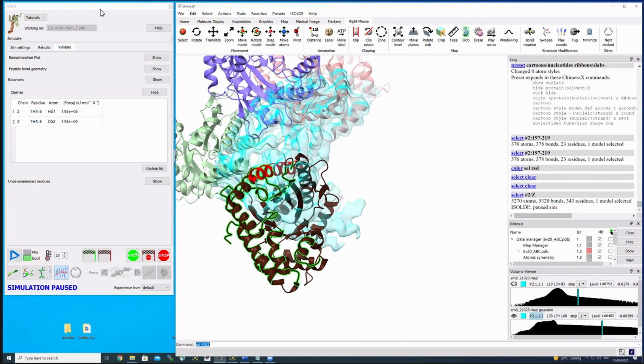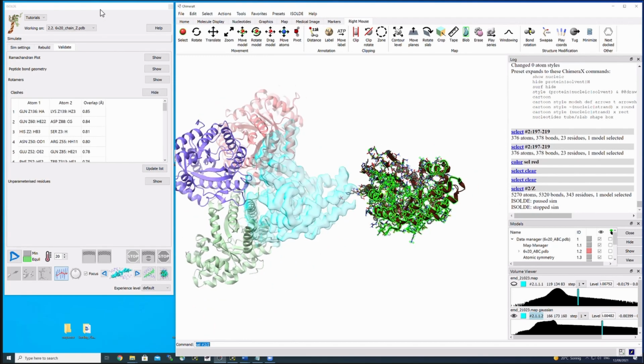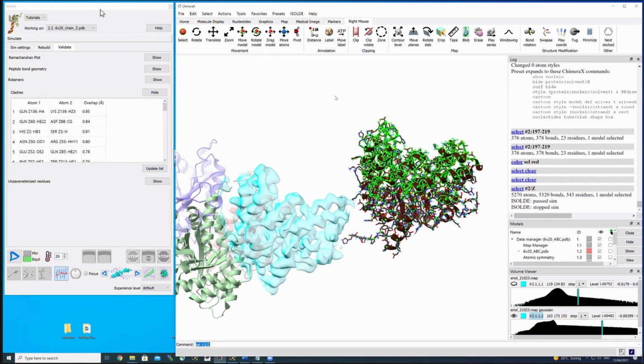Oops. There was obviously a problem with a clash occurring. That's typically not happening. Yeah, okay, this is what it is. So I just clicked on stop. It goes back to the original coordinates.